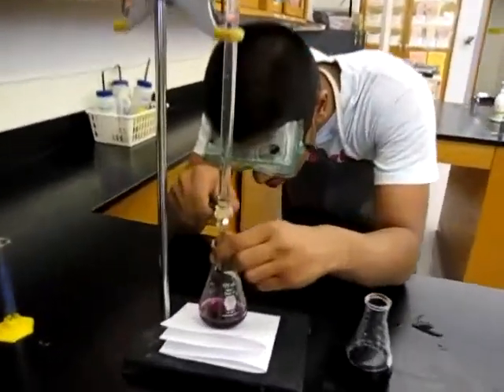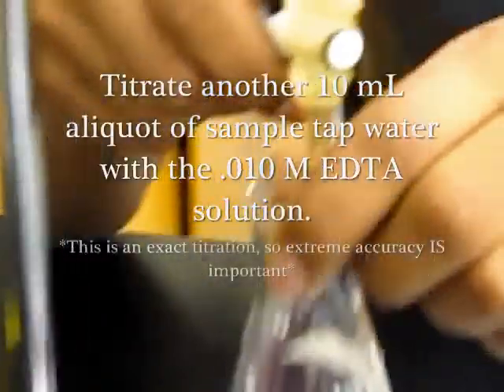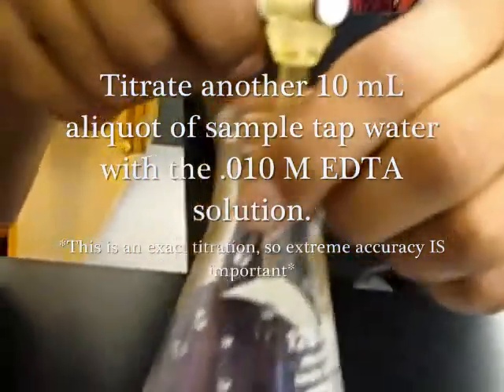Now, perform an exact titration with the second 10 milliliter aliquot of sample water. When you reach near the endpoint of this titration, be sure to titrate one drop at a time to ensure optimal accuracy. The endpoint of this titration is reached when the color of the solution changes from purple to blue.